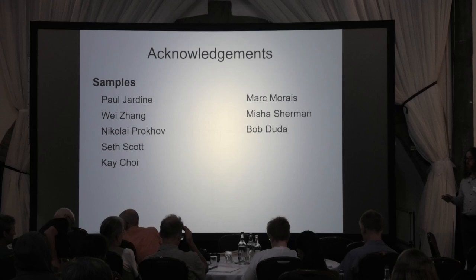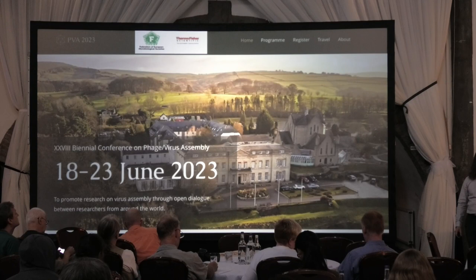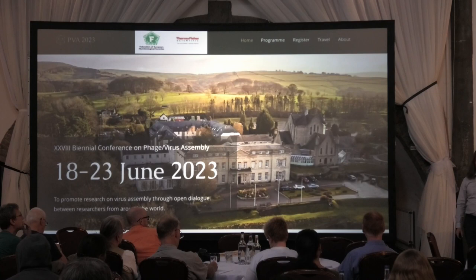Hi, Michael. Thanks for the talk. I'm wondering if you see those helix-turn-helix densities that you'll find in these capsid proteins. Do you see those in the equivalent positions underneath the MCPs that are surrounding the portal vertex? So, we don't see any unaccounted for density at the portal.